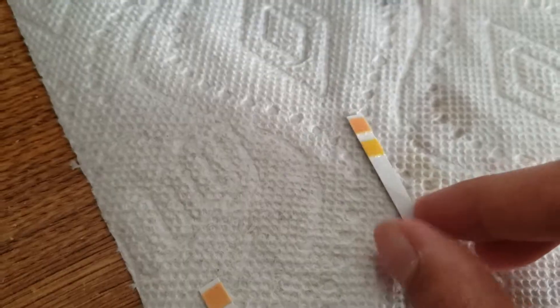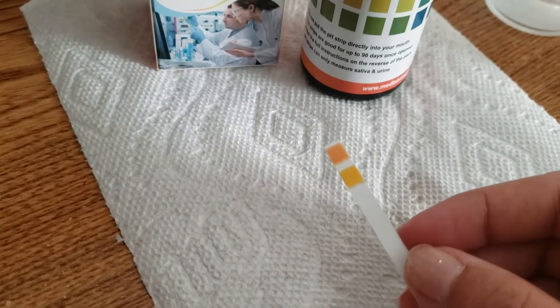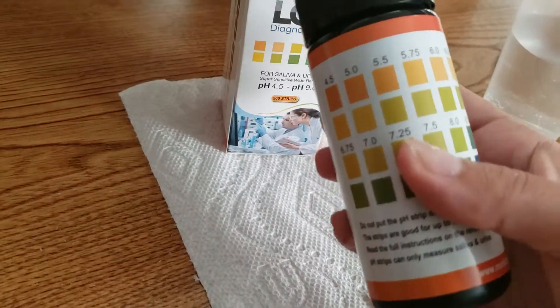It's already starting to develop. Give that a couple more seconds and then we're going to go ahead and check our results against the chart on the bottle.